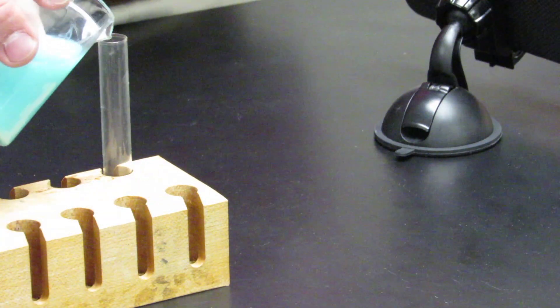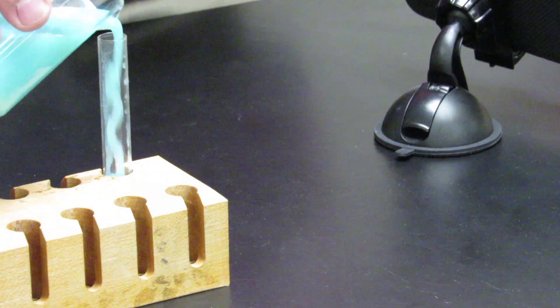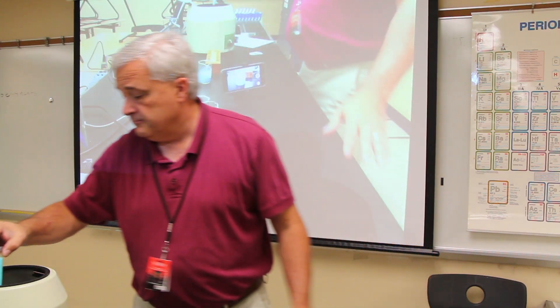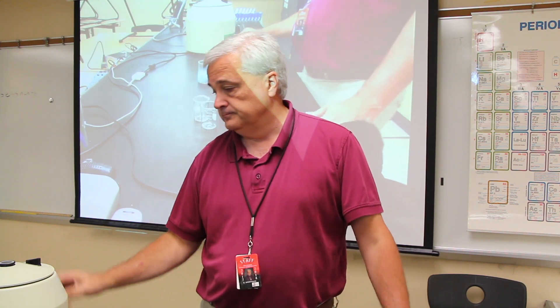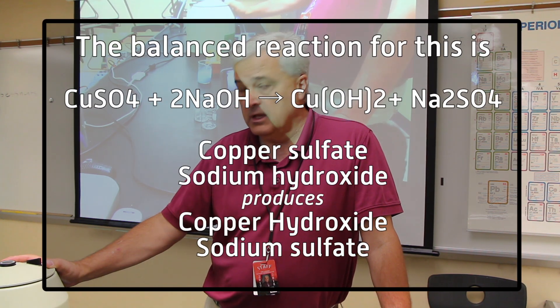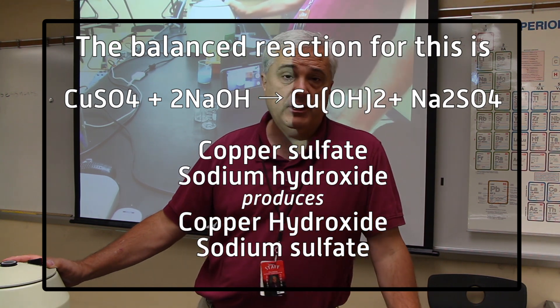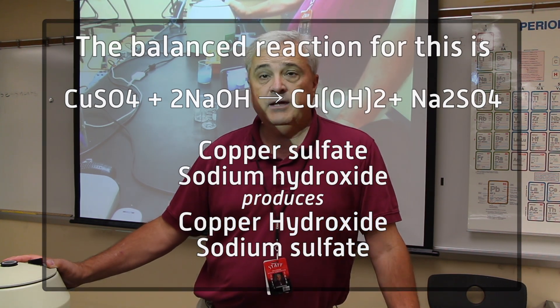But we're going to use the centrifuge and speed that process up. I'm going to put about half of the test tube in, and we'll speed this up. What we're expecting to see happen is the centrifuge will separate the particles by density, and we're going to end up with the particles at the bottom and the liquid at the top.